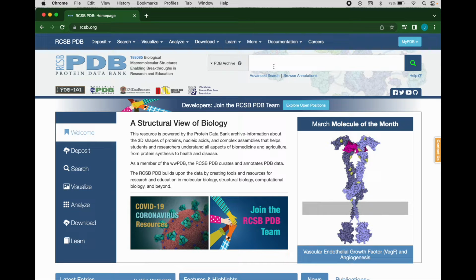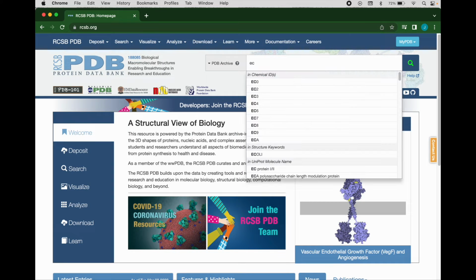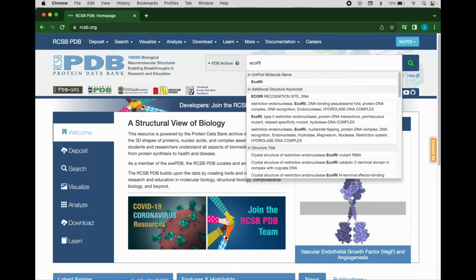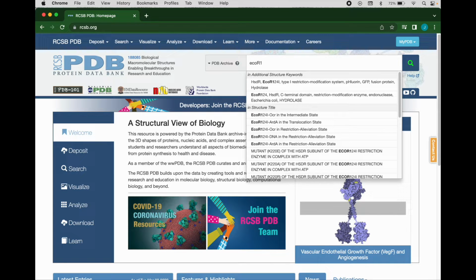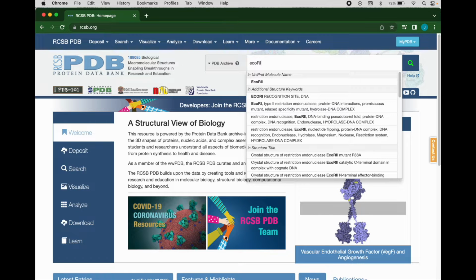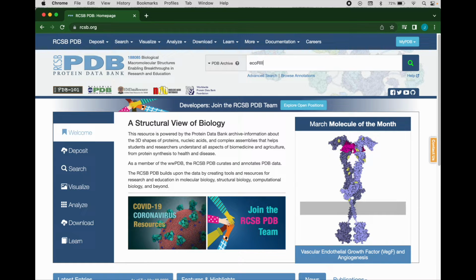Okay, so if you have read the instructions for the Digest It kit, you'll know that one of the restriction enzymes is EcoRI, which is actually typed with an I instead of a 1. If I type a 1 like this, it gives me a quite different EcoR124I. So it's kind of funny with restriction enzymes, the 1 is like an I or the 3 is like 3 I's. I guess it's more Roman numerals in that regard.